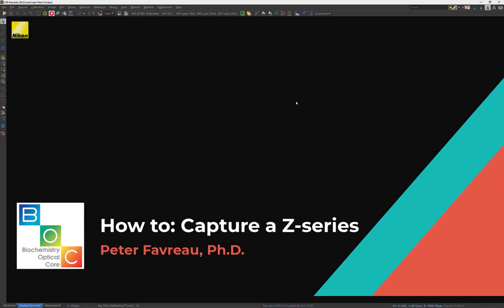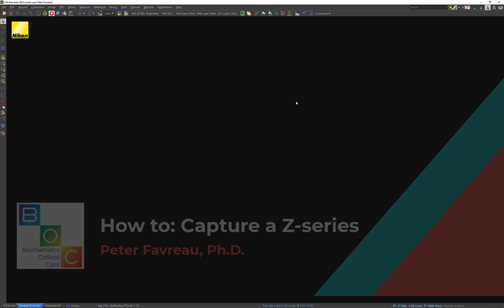Hey guys, Peter here. Today I just wanted to talk to you guys about how to acquire a Z-Stack.